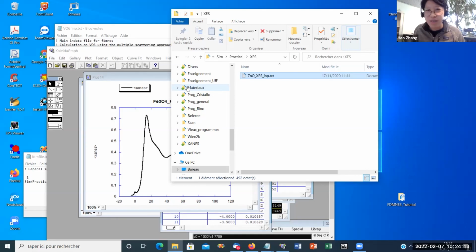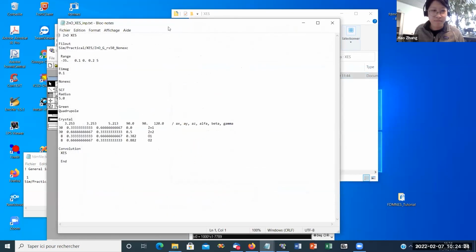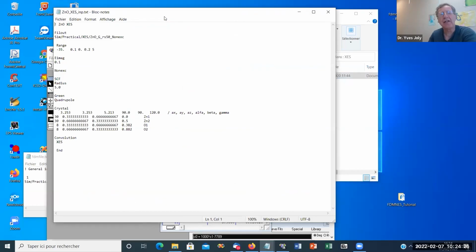For the X-ray emission calculation, how do we define how to calculate the main line or the valence to core from the code? In fact, I don't define them. The code just goes through this energy range. If you go to lower energy, if you start at, I don't know, minus 200, it will automatically probe all the lines.